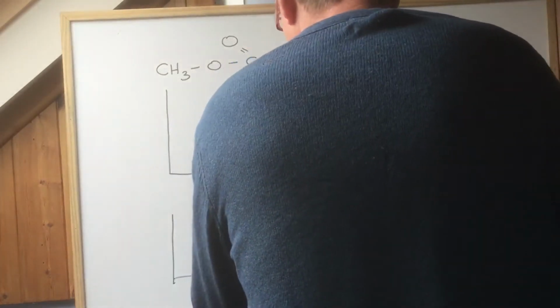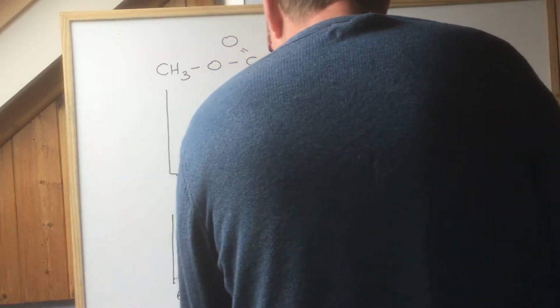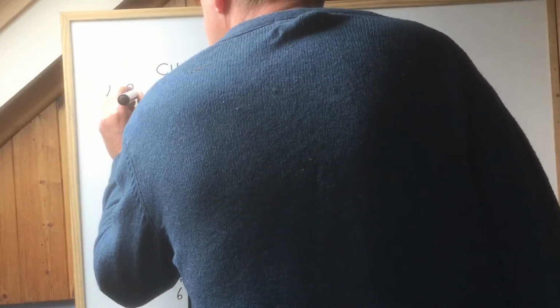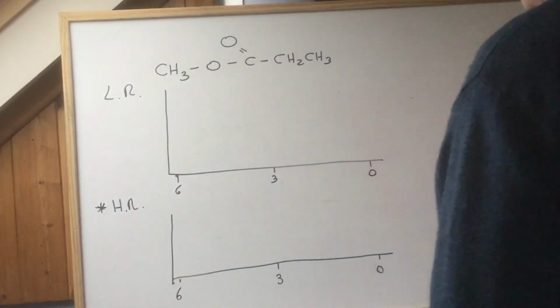This could all go wrong. 6, 3, 0. Low resolution, high resolution. This one, I'll show the very first splitting patterns that you've ever seen.